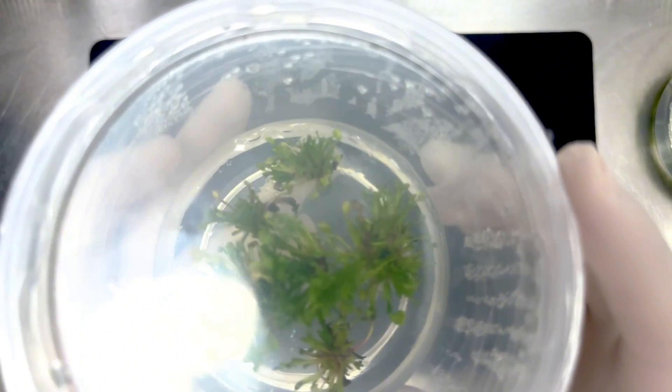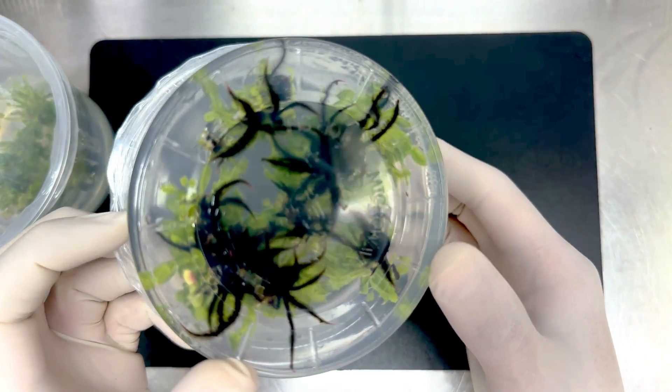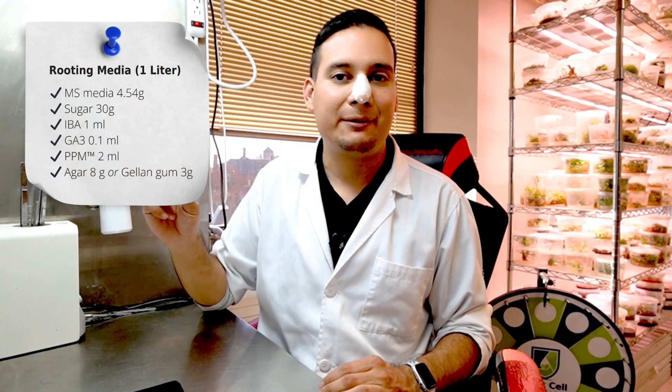Rooting plants. When you have enough plants or they have grown large enough, it is time to transfer them into rooting media. This media encourages the plants to form roots, which is the next step in their development. You can copy this houseplant media for rooting.